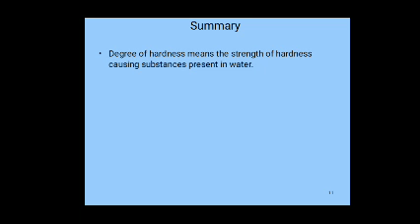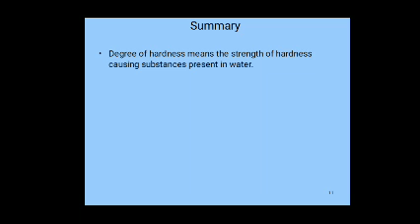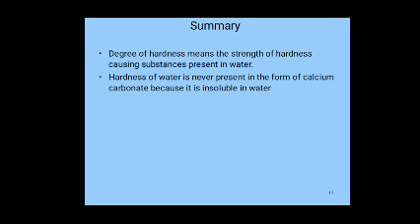Degree of hardness means the strength of hardness-causing substances present in water.